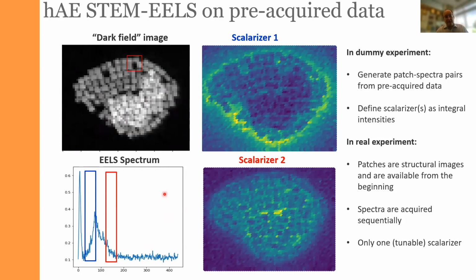It's convenient because we don't need to deal with the alignment problem. We don't need to deal with the drift. We just operate on an ideal microscope. We cannot do new measurements, but the measurements that we have are already good.